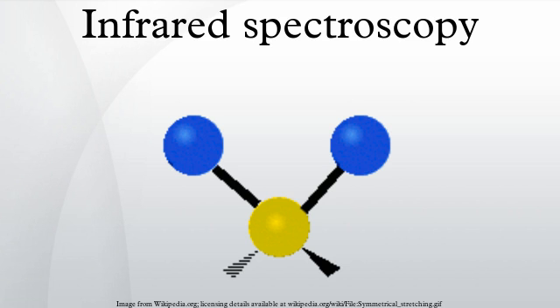This technique is not perfectly reliable. If the infrared lamp is a bit brighter during the reference measurement, then a bit dimmer during the sample measurement, the measurement will be distorted. More elaborate methods, such as a two-beam setup, can correct for these types of effects to give very accurate results. The standard addition method can be used to statistically cancel these errors.